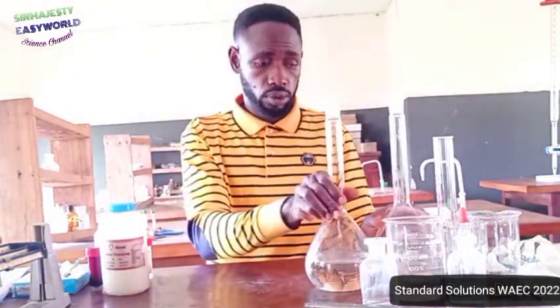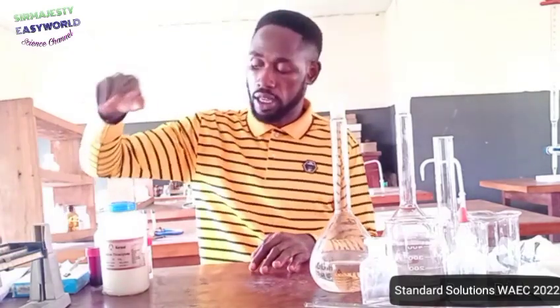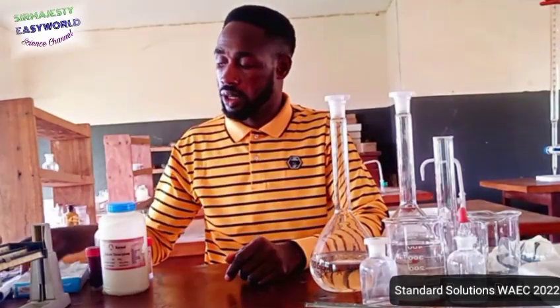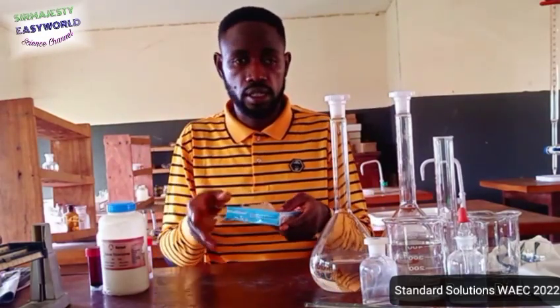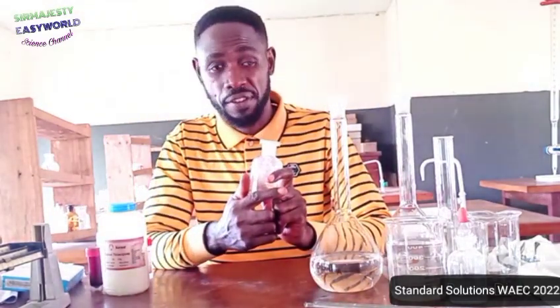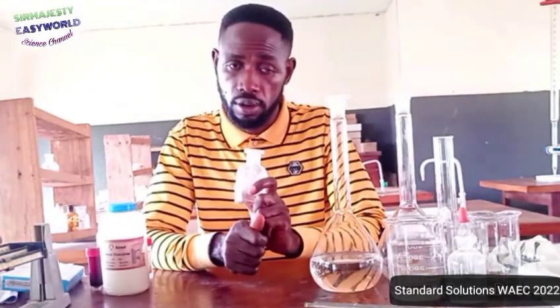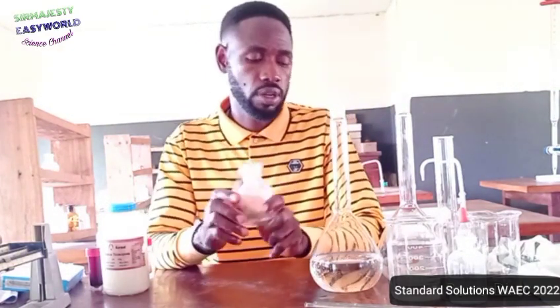Then you need your weighing balance, very necessary. Then you have your spatula too. Then you might need filter paper just for weighing as a container as you weigh these things. But remember to note the weight of the filter paper in your weighing. Then I have a small reagent bottle for 150 cm cube. So if I have 10 students, I will provide about 10 of them according to the specification. So if I have 100 students, I require at least 100 of this.